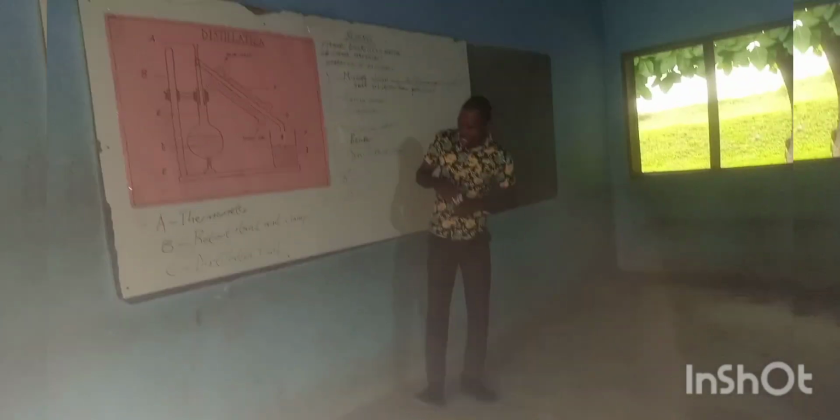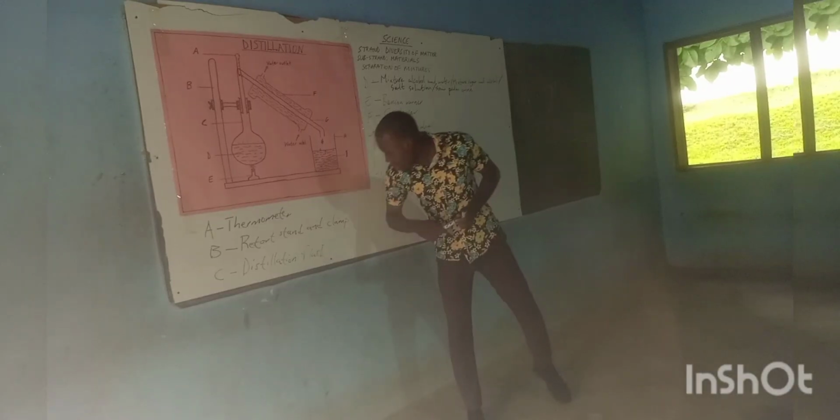Flask. It holds the distillation flask in position. Alright, that is the function.